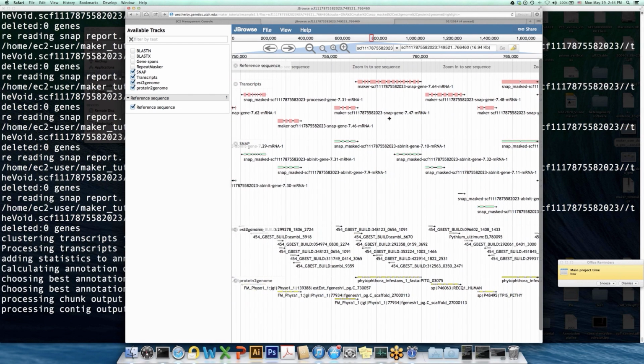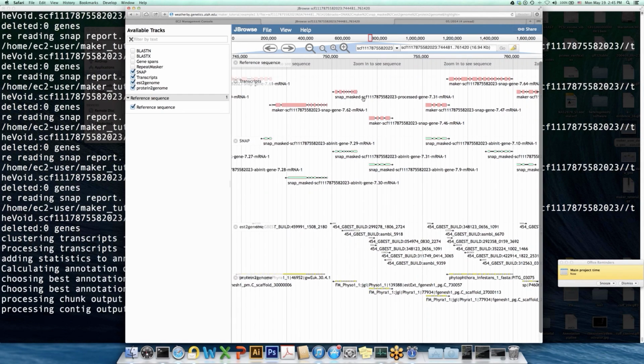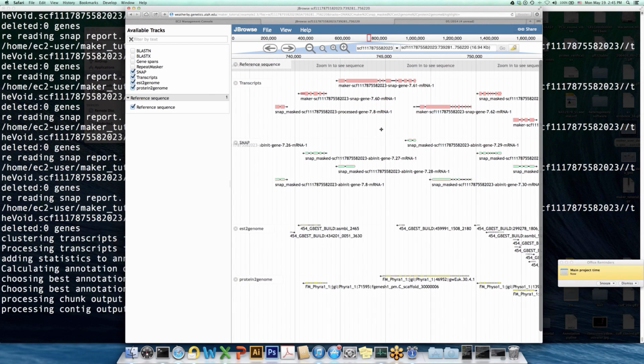So if you were to just run Snap in this genome at this time and not even run Maker, you would probably recapture most of the genes almost just as well as Maker does. Maker does a better job because it's able to take the evidence into account, but a well-trained gene finder works well. It's hard to get it trained. Augustus works extremely well when it's trained, as seen by some of its statistics, where you can recapture 80 to 90% of the gene structure just using the HMM across an entire genome. But it's really hard to get to that point. So that's why the Maker model, where you let Maker talk to the program for you, works so well, because it gets around a lot of the hassles of trying to figure out how to get your gene predictor to behave.